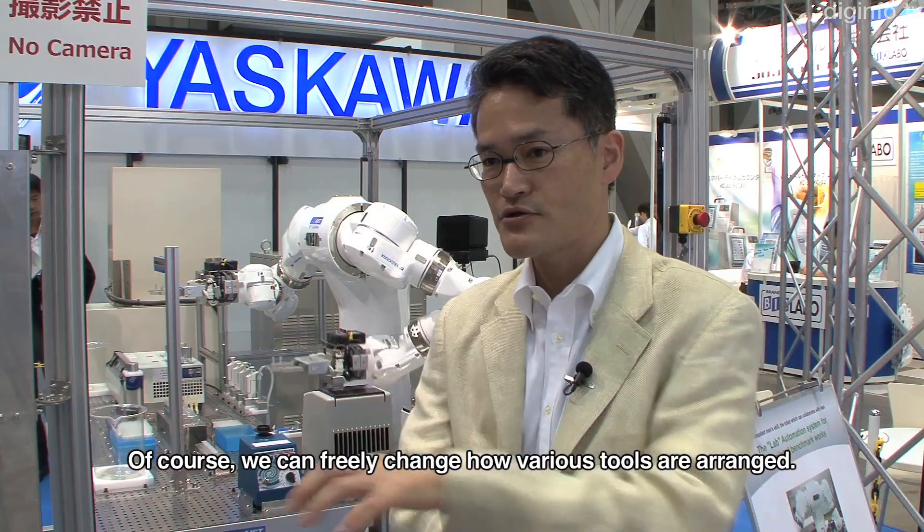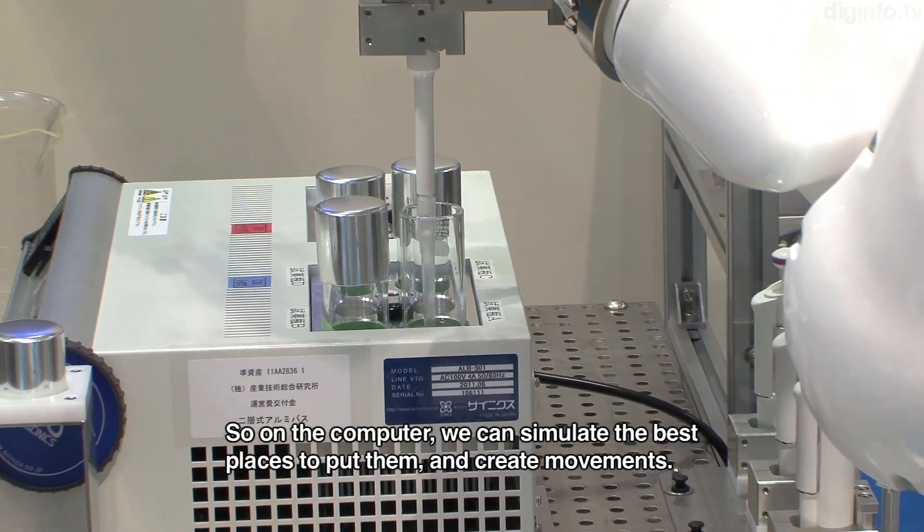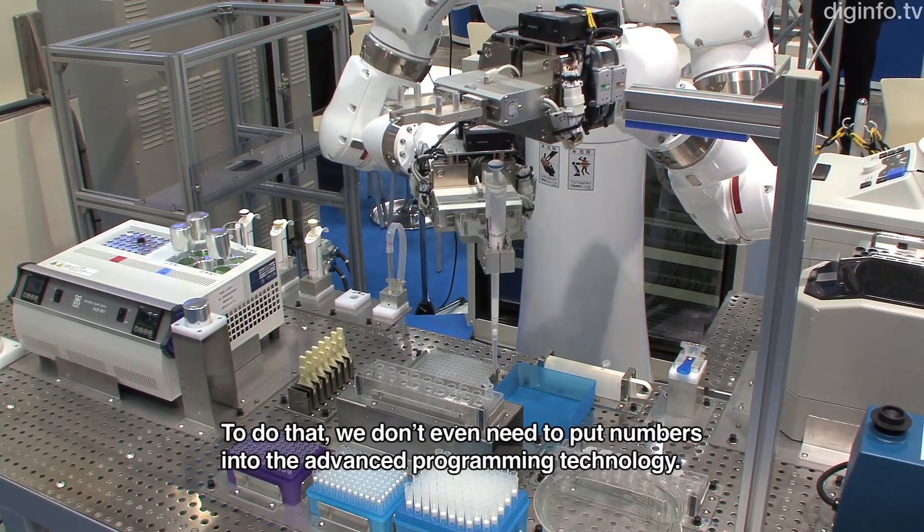You can easily replace various tools, and create movements in the computer without the need for a large amount of programming.